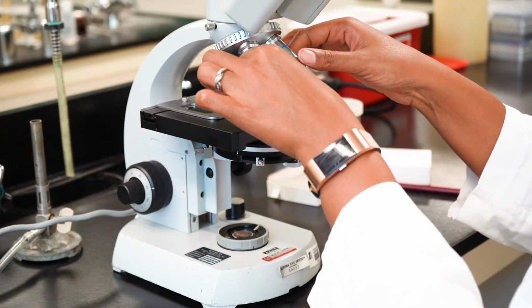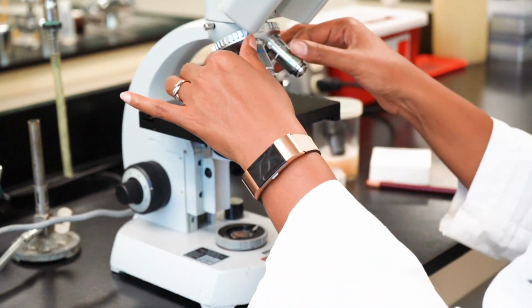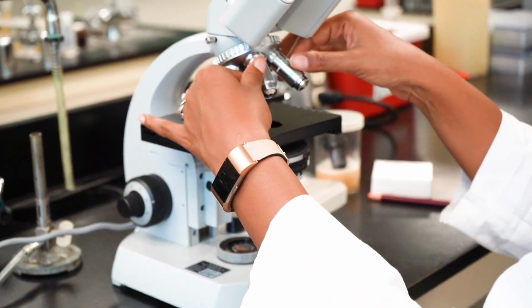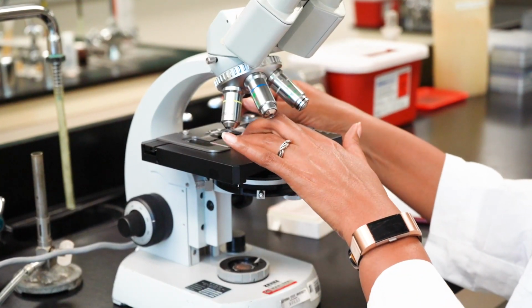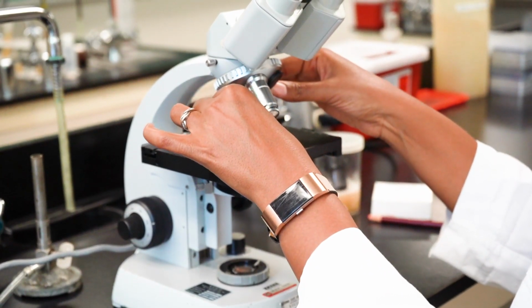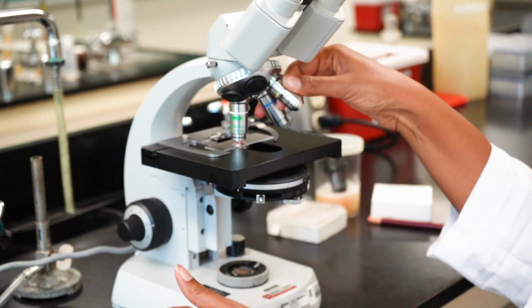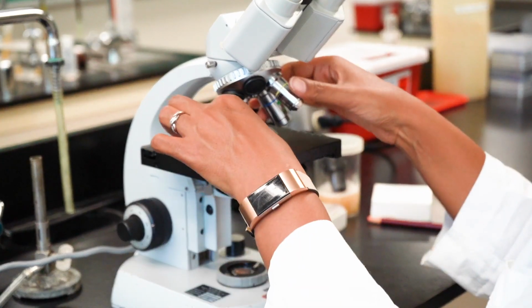And so if we were then to view our specimen, we would put our specimen back on the stage without making any adjustments to the height of the stage. You can then put your specimen back on there and then view it at low, medium, or high power, and at no point should the lens make contact with the specimen.